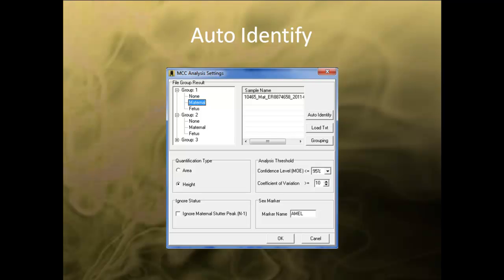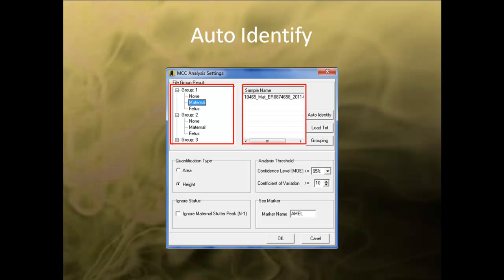After selecting the appropriate groups, the MCC Analysis Settings dialog box will display the number of groups or individuals determined through grouping on the browser pane. The browser pane also displays categories such as Maternal, Fetus, Positive Control, Negative Control, and Ladder. Positive, Negative, and Ladder samples are automatically recognized by ChimerMarker and placed into the appropriate category. When you select a group, the samples for that particular group are displayed on the right side. Click Auto-Identify to automatically place the sample file into the correct category for Fetus and Maternal Sample.